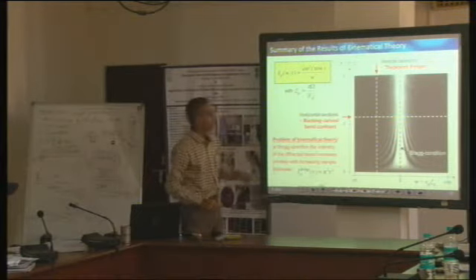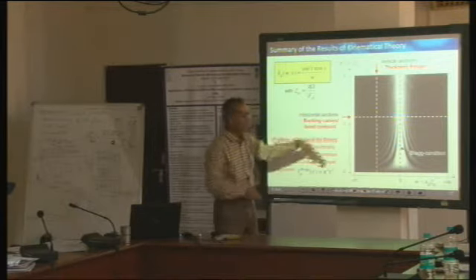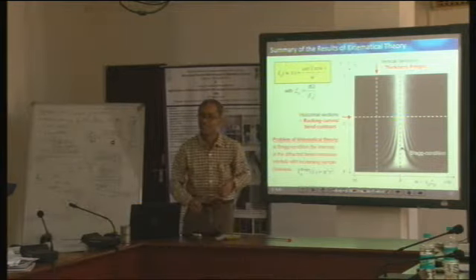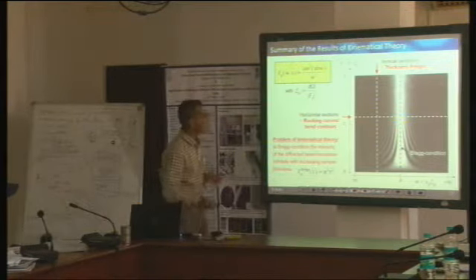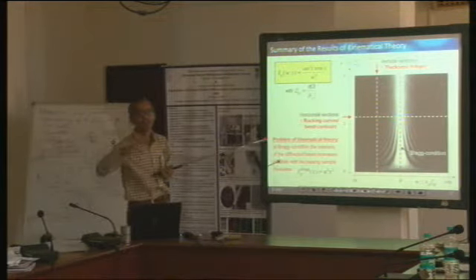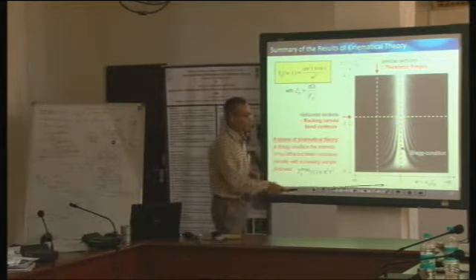And when we do that, we are going to get the intensity as a function of these two parameters. Let us look at now the inadequacies of this equation derived by kinematical theory or kinematical scattering assumption. Here it is 0.